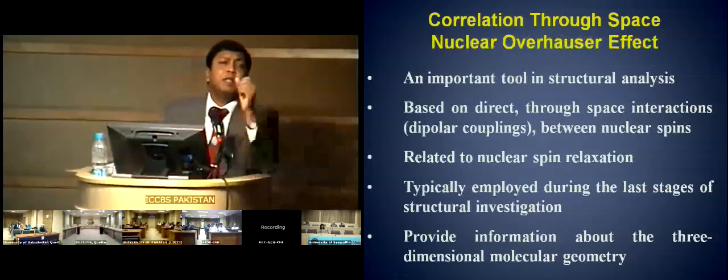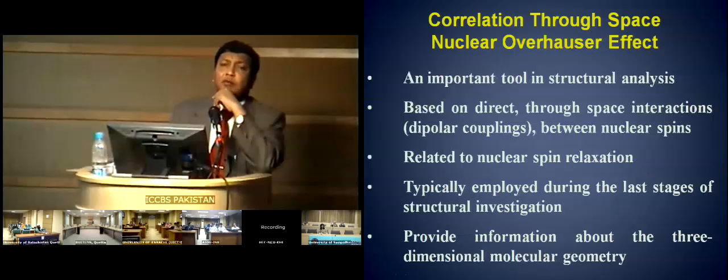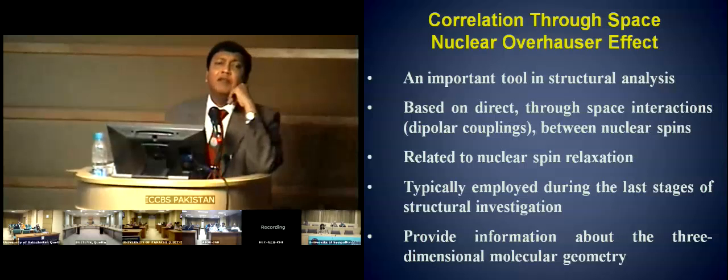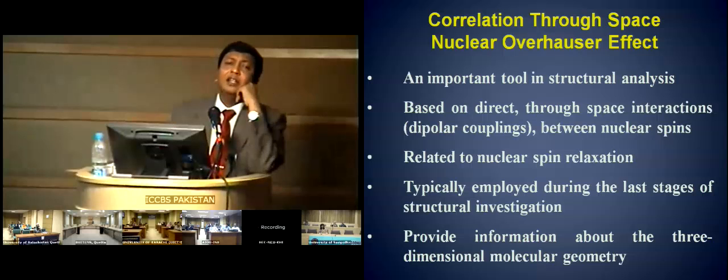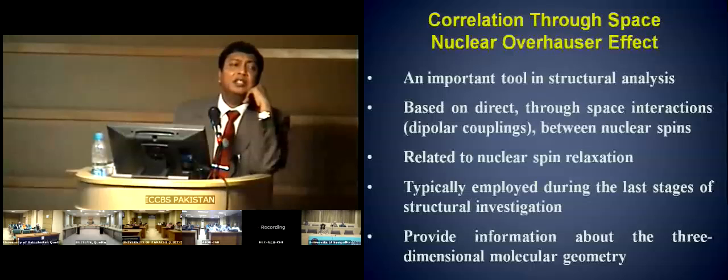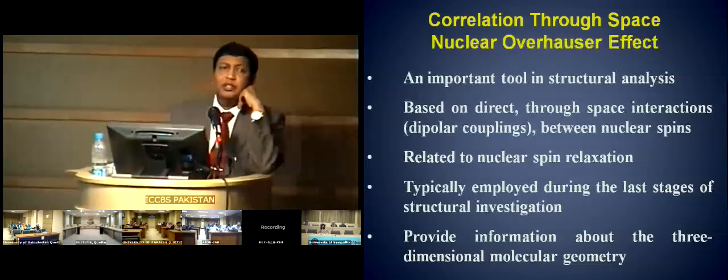Okay, now what we have done, we've gone through a very extensive process of learning, and we learned a number of things. For instance, number one, we have learned that a simple proton NMR spectrum is recorded by a 90 X pulse and starting a detector. We learned that the intensity of signals can be increased as compared to noise by using a pulse Fourier transformation.